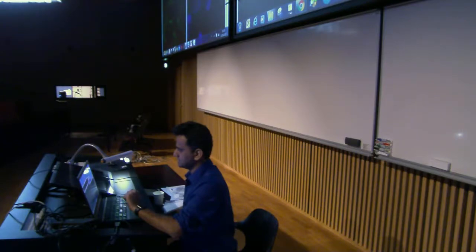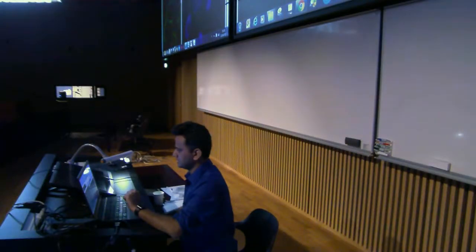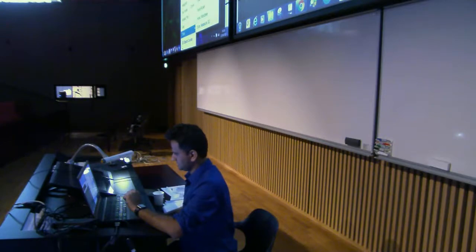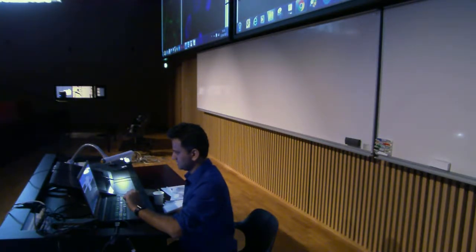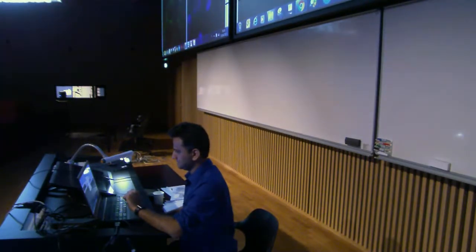Well, there is only one. Same thing, you have to do it for analyze, tools, scale bar, no overlay, fine. Analyze, tools, scale bar, make it blue. Okay, this one is tools, scale bar, make it green.